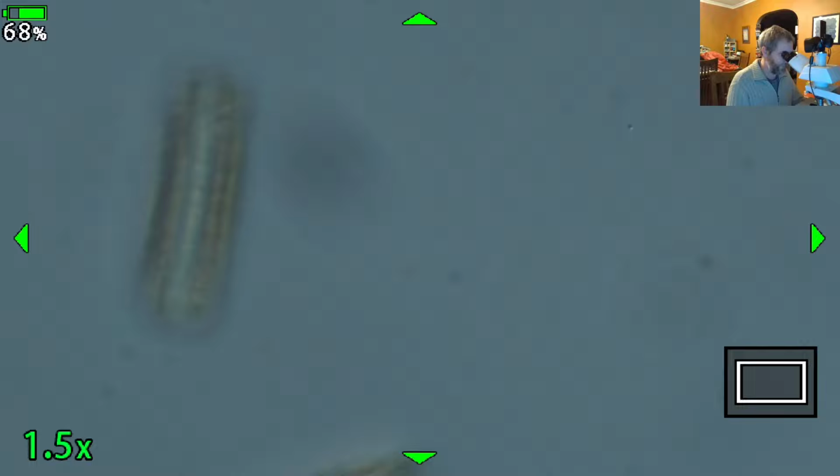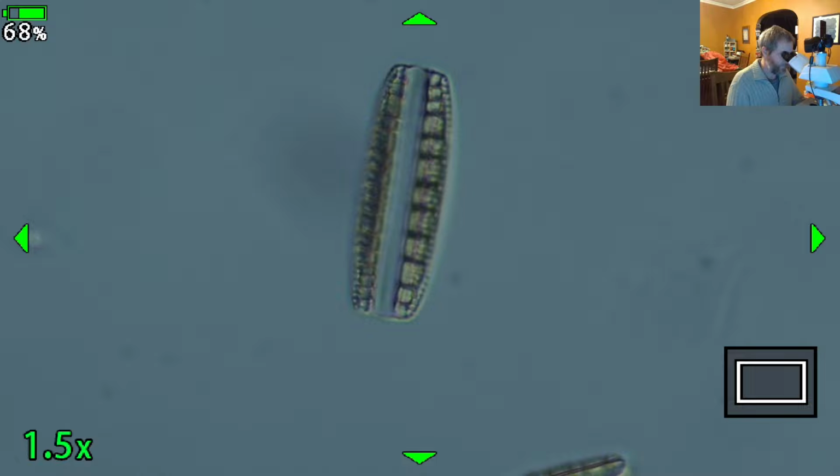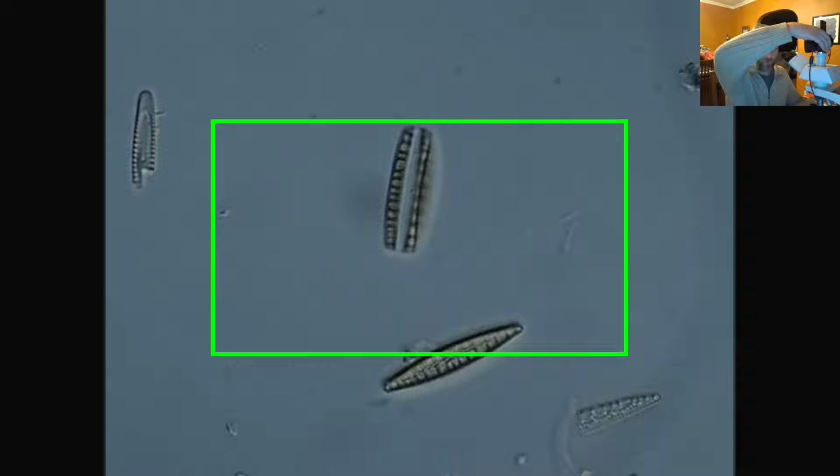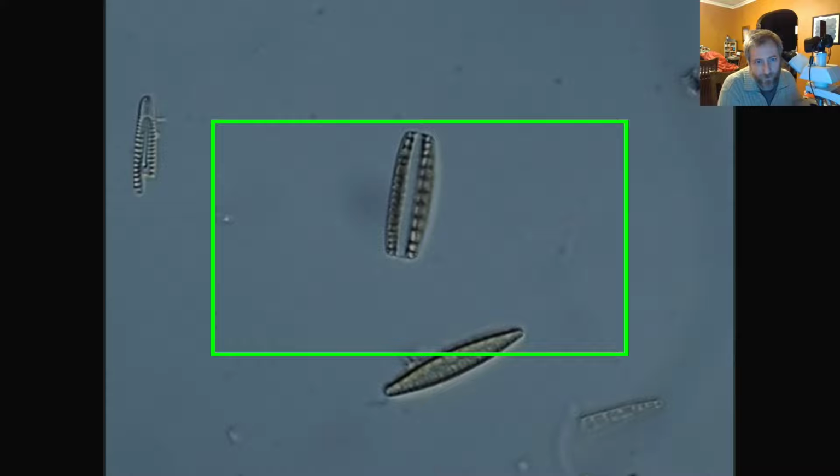Here's a whole bunch of the Grunauia that we were talking about before. Here's some in girdle view, and get rid of the zoom for a second. There's some in girdle view and also some in valve view. So that's nice because you can get a nice three-dimensional understanding of the diatom.